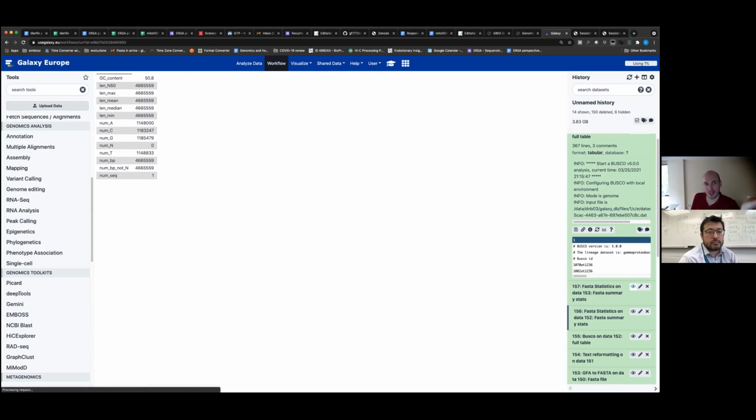You technically can run it also on the alternate. My pipeline was actually doing it, but of course here it doesn't make sense because we're talking about a very fragmented assembly, like the BUSCO score that was being shown. Actually, we're talking about 30 kb overall. No, maybe a bit more, 80 kb. Okay, and this is, let's say, little junk.